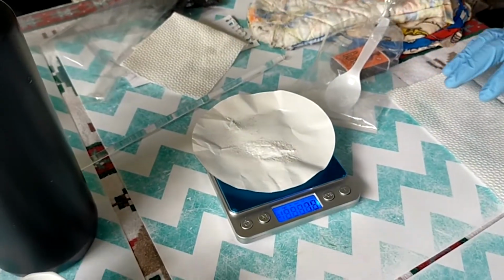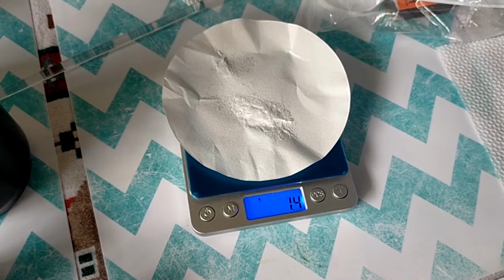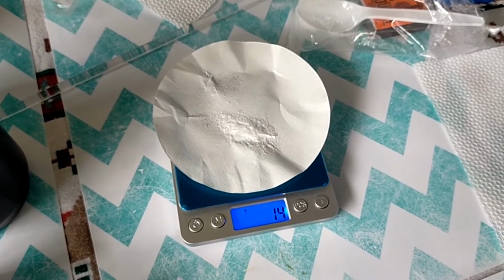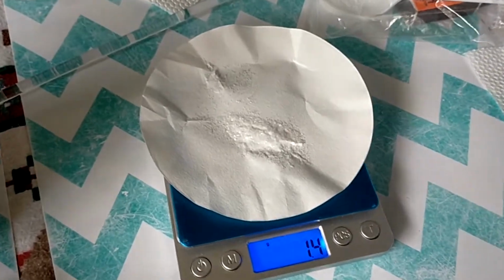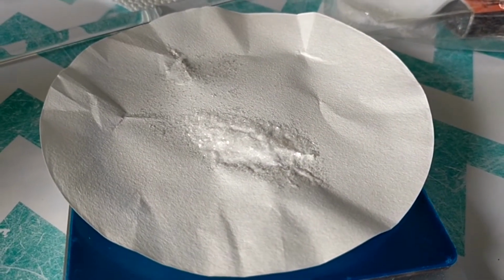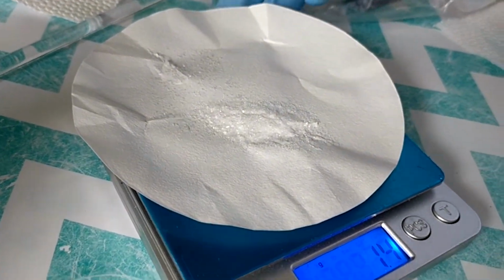Weighing. Now, the final weight of our dried naphthalene is 1.4 grams. Now, remember that the original weight of our filter paper is 1.1 grams, so that leaves us with a pure crystallized naphthalene amount of 0.3 grams. So from the initial 1 gram of original naphthalene, we were able to recrystallize 0.3 grams of pure naphthalene. So that is it for this experiment.